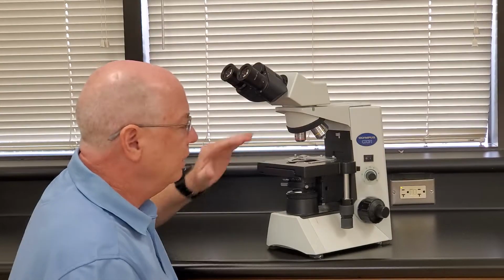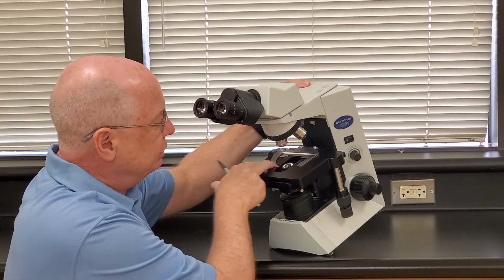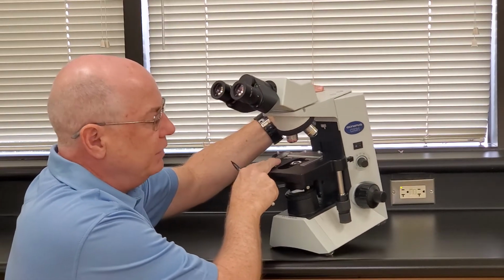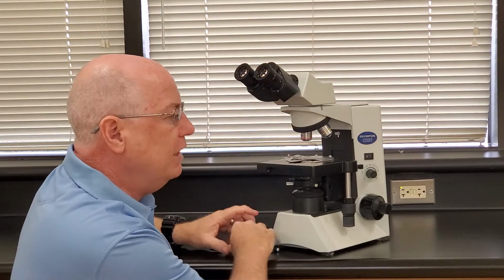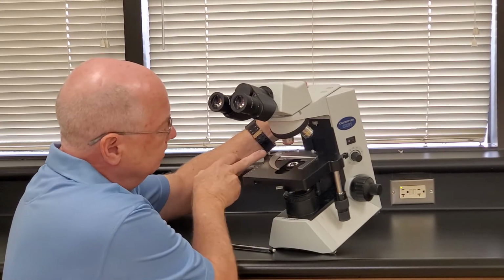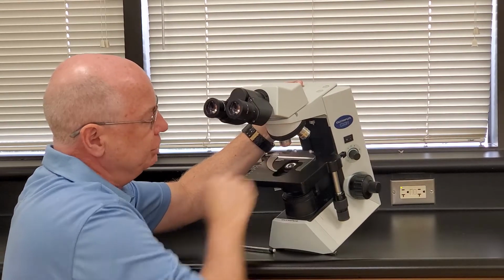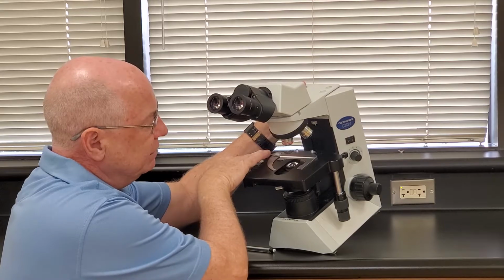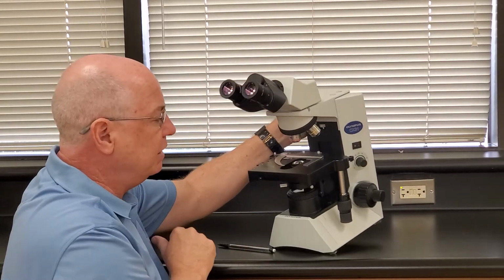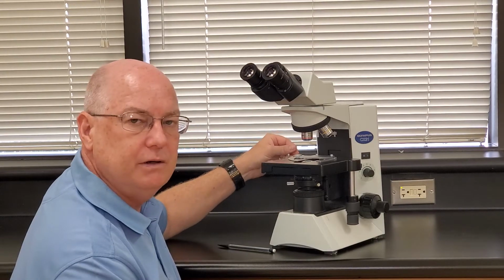The mechanical stage. Now, if you look down on our mechanical stage, there's a little metal clip here, and that's where we put our slides. If you were going to mount a slide, the first thing you do is you open up this little clip. You put the slide in this very back corner here where it's L-shaped, and then you very gently set the edge of the stage clip on the edge of the slide. They are spring-loaded, but don't let them go because they'll snap and chip slides.